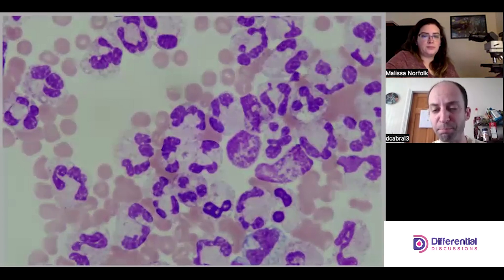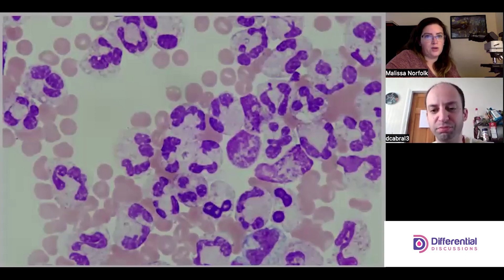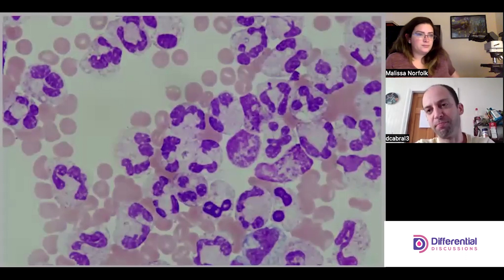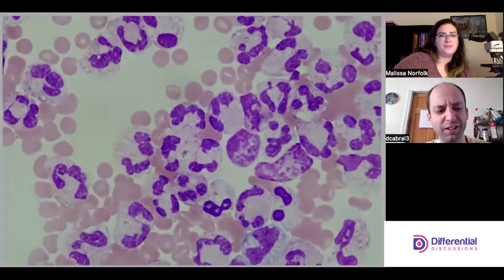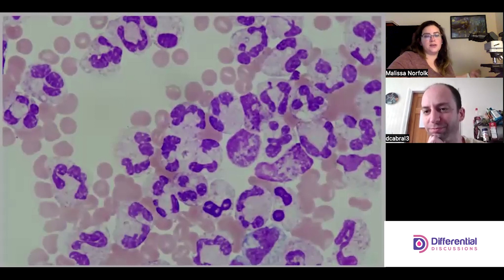We don't really see gout crystals on smears — we will see pseudogout. We don't see gout because when specimens are in EDTA, which is typically what we put synovials in, the EDTA dissolves the gout crystals. So we won't see gout on the smear, but we will see pseudogout.